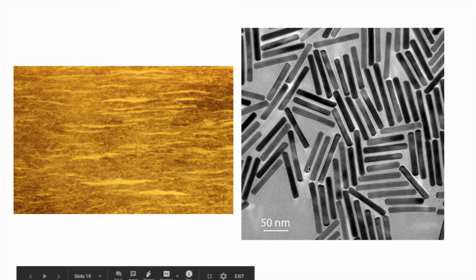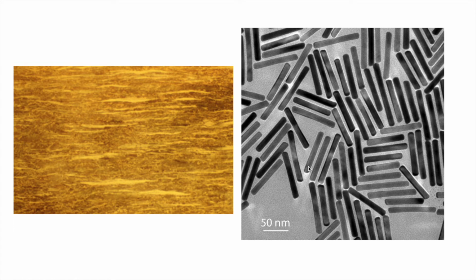The same thing can actually happen with a powder or a sample that does contain discrete particles. So this is an example. We have single crystals. Each one of these pieces is a single crystal. However, this is a single crystal of a metal that's shaped into a very specific rod-like shape. And those grow in a very specific direction relative to the crystallographic direction.